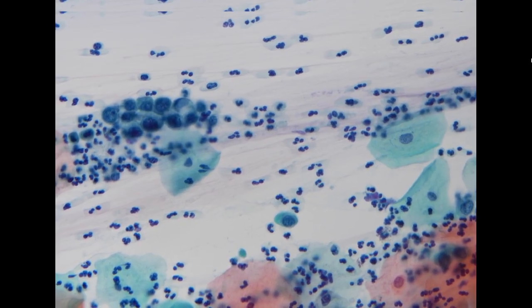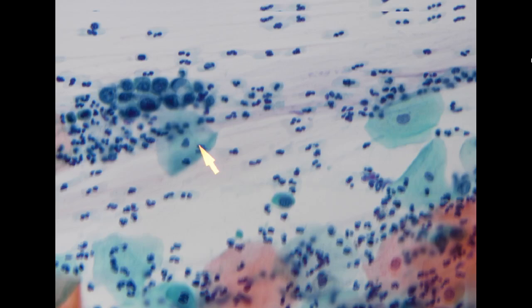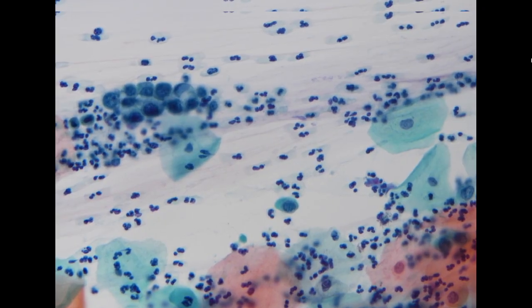Just like what I said, when we identify this, we call it a hyperchromatic crowded group. First of all, we need to determine whether these are squamous or glandular, or coming from the endometrium, etc. If we are uncertain based on only a single cluster, we just move around the smear.